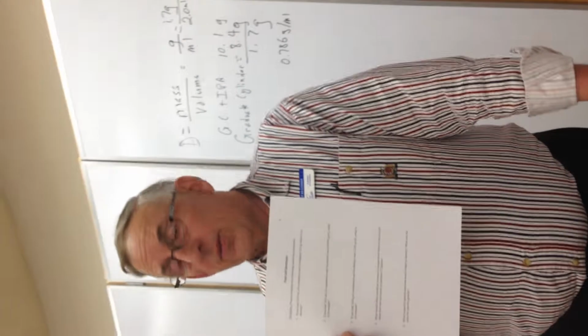The exploration was doing the experiment, and the evaluation of the lab for them, they would be sending me a video of this lab, plus they would send me their pre-lab questions, their post-lab questions, their data sheet, and the lab report. So this will conclude this lab today.